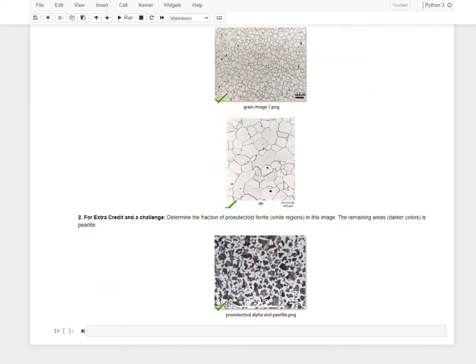And then this is the sample that's actually in your Callister text. So this comes right out of the Callister text. And then there's your 100 micron bar. So when you call this one in, once you get this micron bar, you're going to have to do a similar thing in that you're going to need to crop it or slice your data so that you're analyzing only the grains, not any kind of boundary that's in there or the bottom.